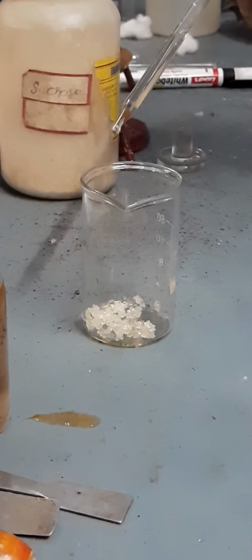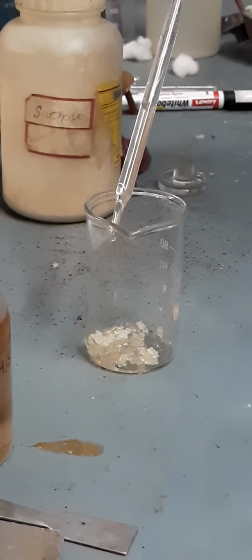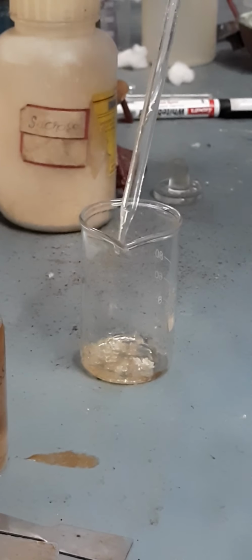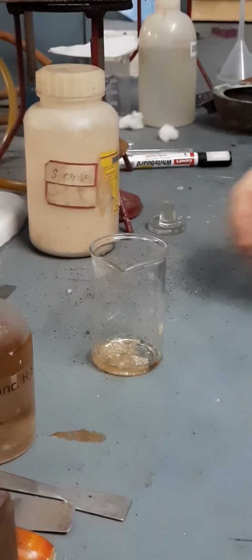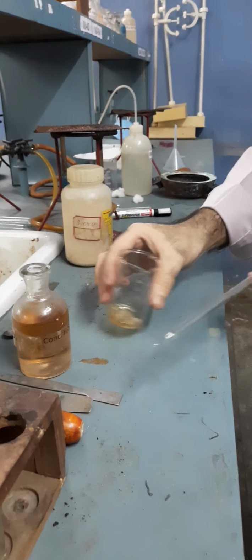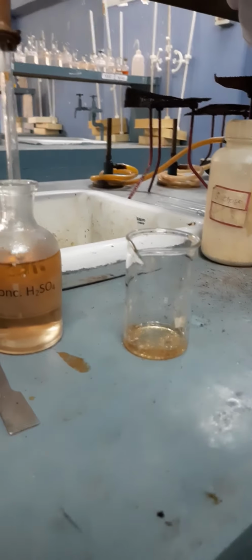We are just adding it drop by drop. We will give some time for the acid to react, and we will see what happens then.